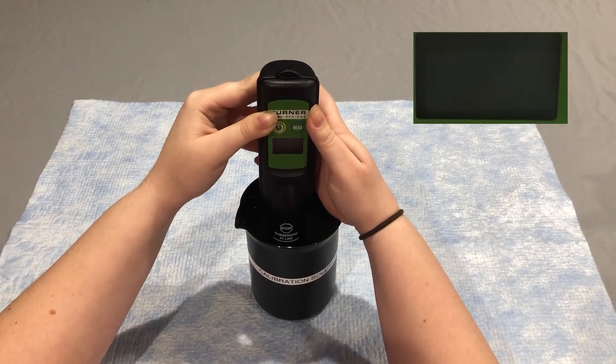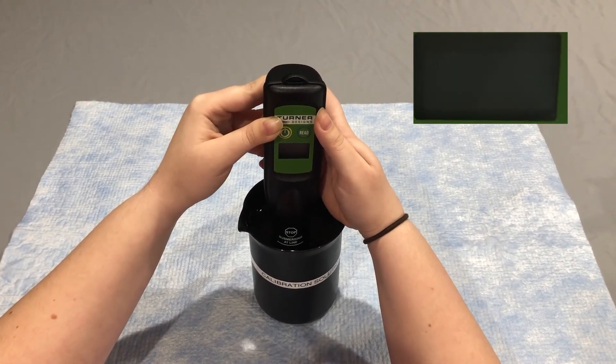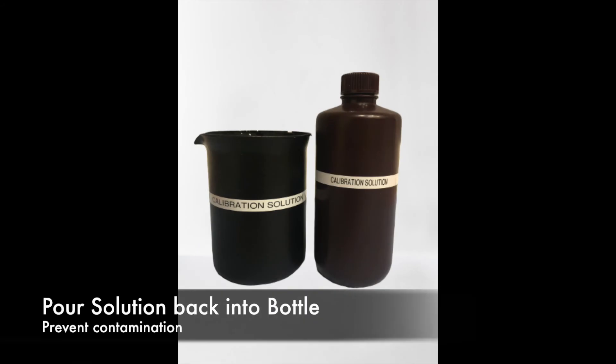Continue to hold the Fluorosense in the solution as TD flashes on the screen four times. The instrument is now calibrated. You can check the calibration using the calibration solution as long as it has not expired, been contaminated, or exposed to extreme temperatures. After calibrating the Fluorosense, pour the solution back into its corresponding bottle to ensure that it does not get contaminated.